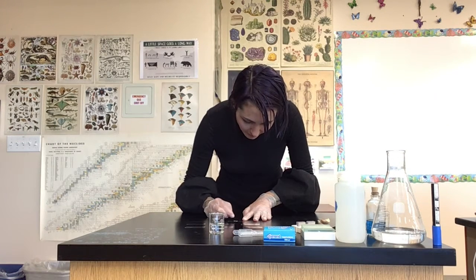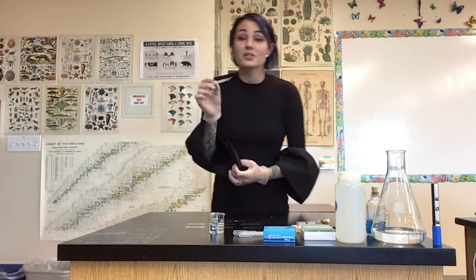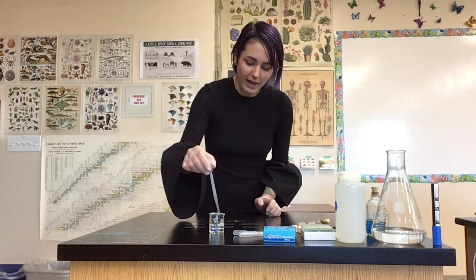Okay, so I've got my roots out. What I'm going to do now is 2 or 3 drops of hydrogen chloride, which remember I had mixed up here.